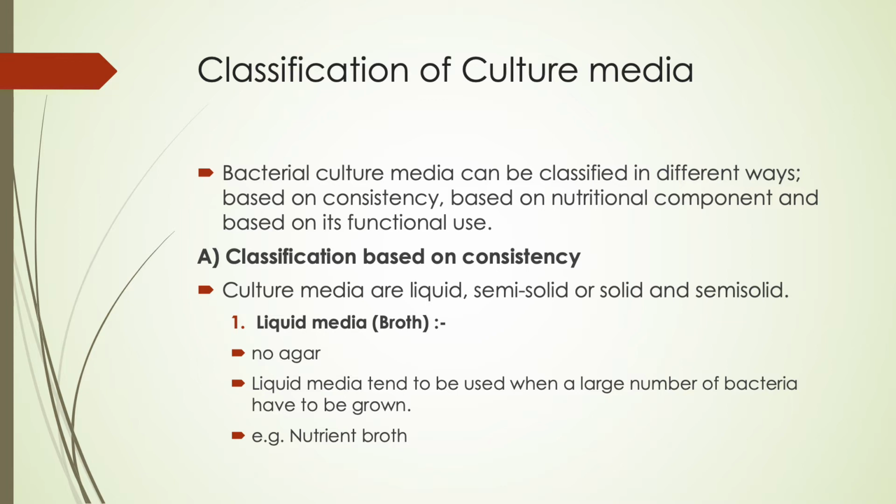For example, you need only the positive bacteria. Sometimes you need only to diagnose the bacteria. You don't care whether it is gram-positive or negative. So we will use, for example, a basal media. So the question is, what do you need? For your questions we have an answer, right? So that answer will specify the culture media.